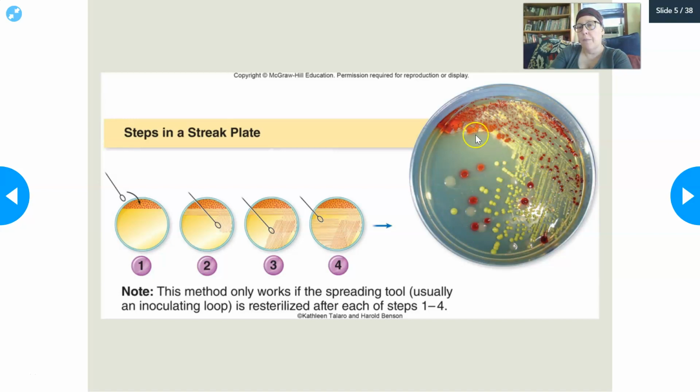Okay, so if your inoculum is too heavy and you don't spread it out, you could have your whole plate look like this, and then basically you have to start over and you lose 24 hours of work, because you do want to get it thinned out where you can have isolated colonies. There's no way, even though you can see the red ones and all that, that you can pick them out without getting some of the others on there.